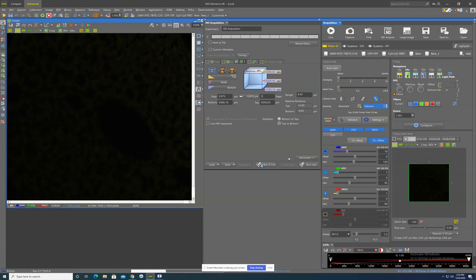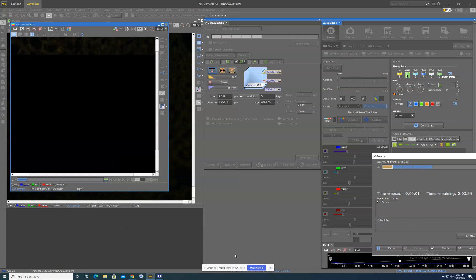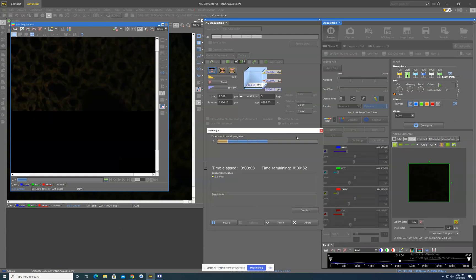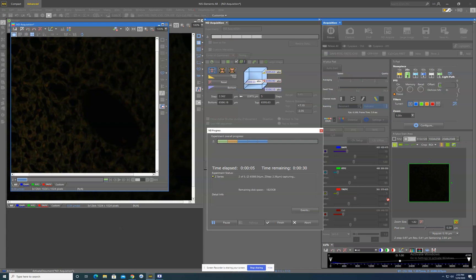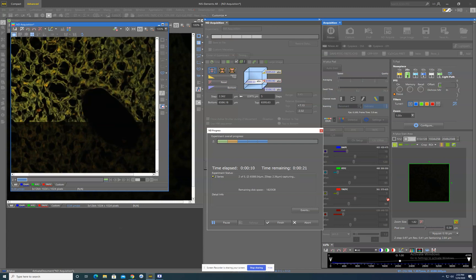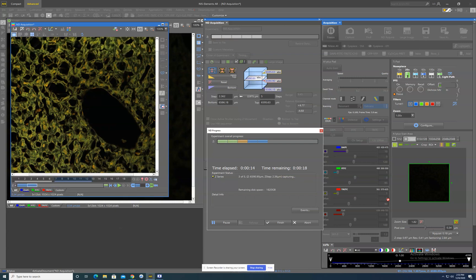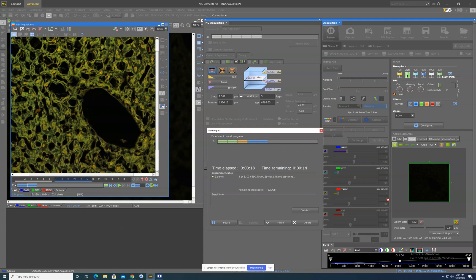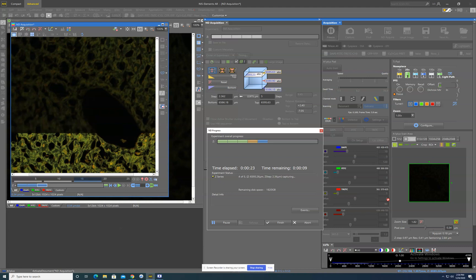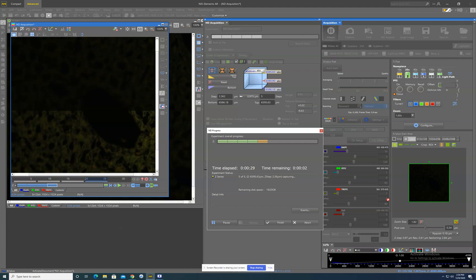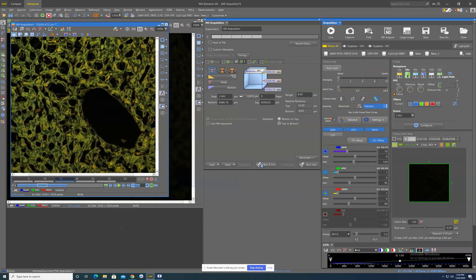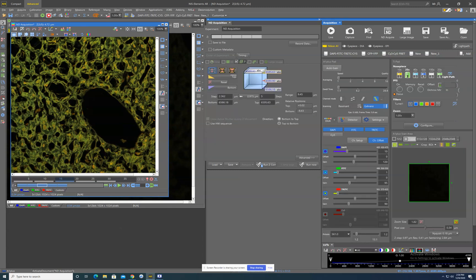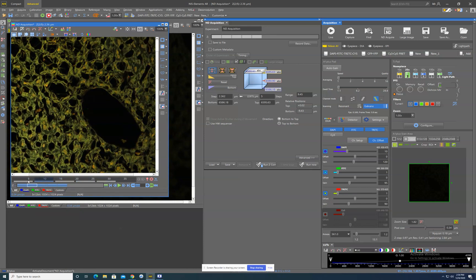Once you have set all this up, you can hit run now and it will take this image. After it's done, it will take a second to process and then it will give you your new ZStack image. This is a single field image because that's what we did. If we did a large image, the large image would also appear at this point. You have your ZStack image right here and you can save it as an ND2. And that's it.